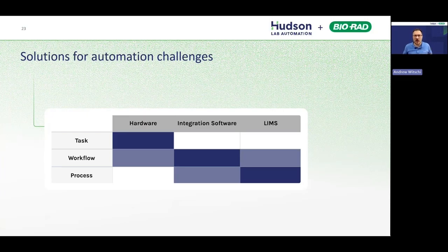When we think about robotic arms or automated incubators, there's components that really by themselves, they don't do a singular task that well, but they are fundamental for supporting workflow-based automation. But kind of the key is that workflow-based automation has tools, both hardware and software, that are designed for that.